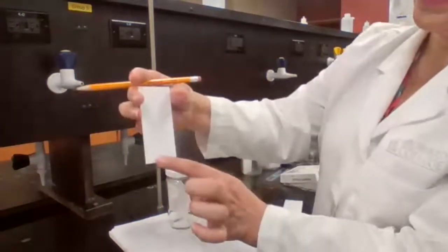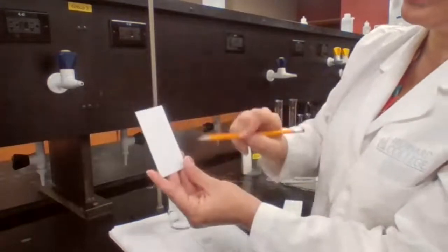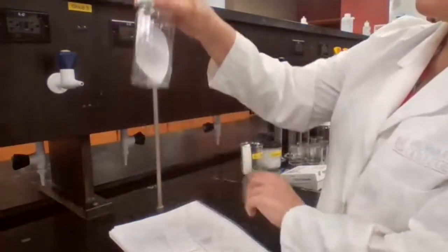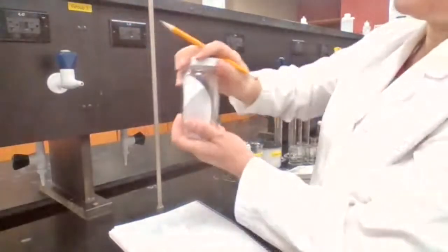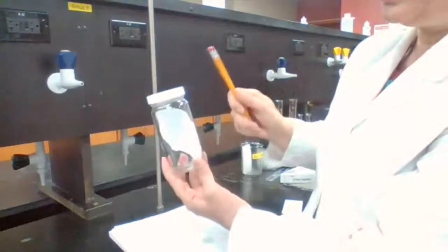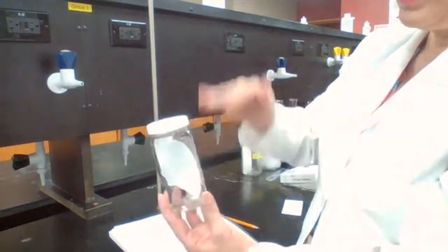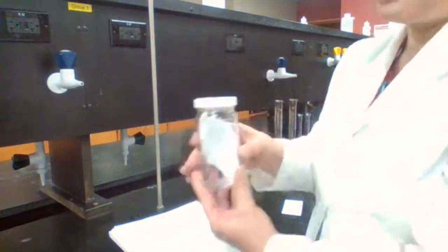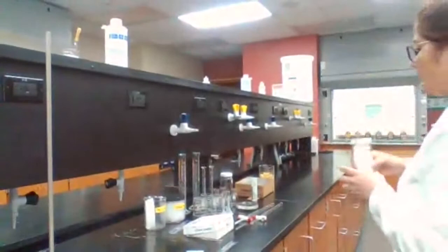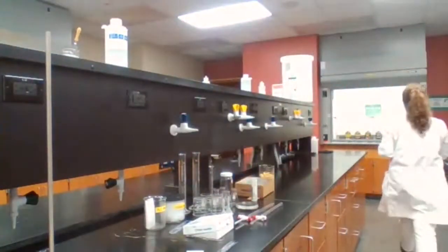So this is my practice plate. This is the one with the chipped edge, so I'm not using this. I'm just showing what could happen. So I'm going to prepare my developing chamber, close the cap first, and leave it for the inside of the chamber to be saturated with the vapor, so I would have smooth travel of the solvent up. I'll be right back. I'm getting the sample from you with the developing solvent.